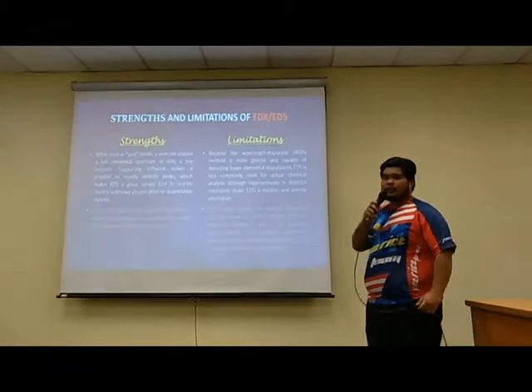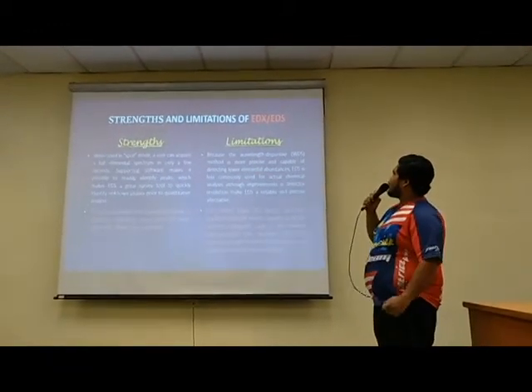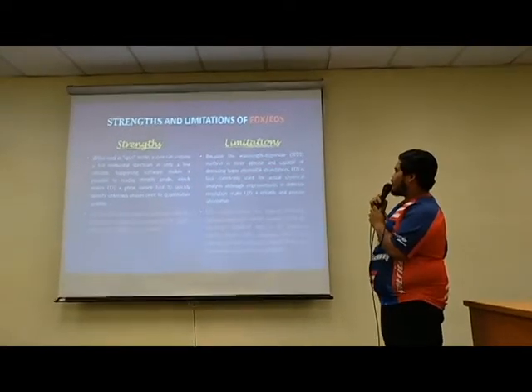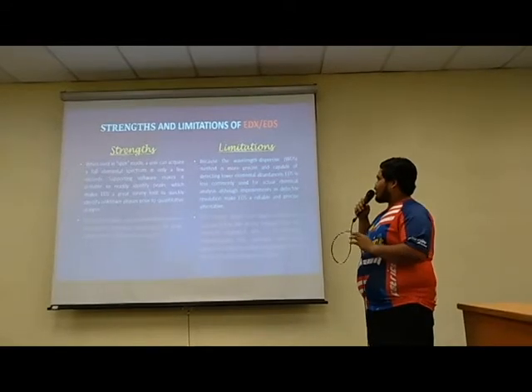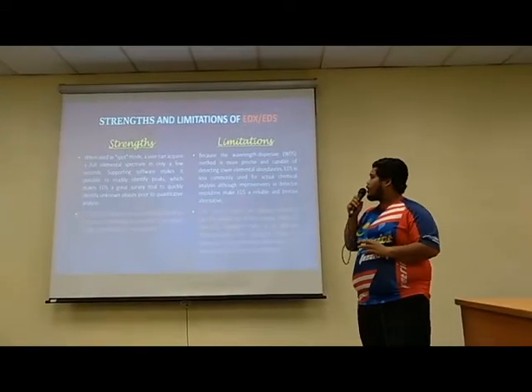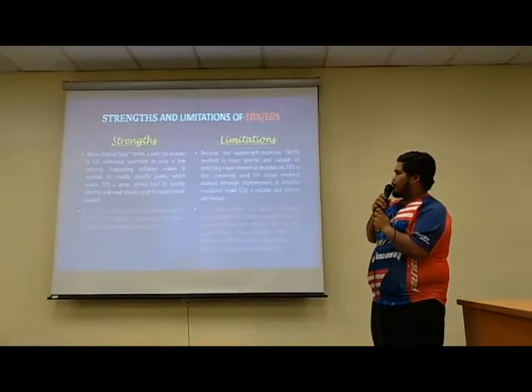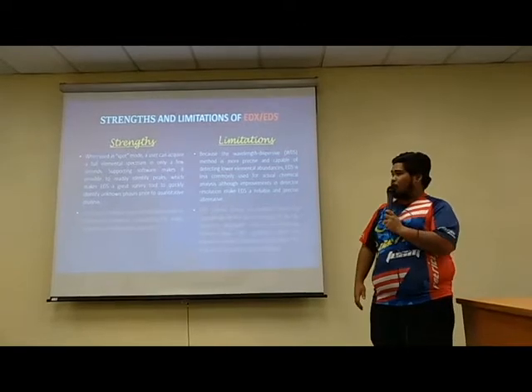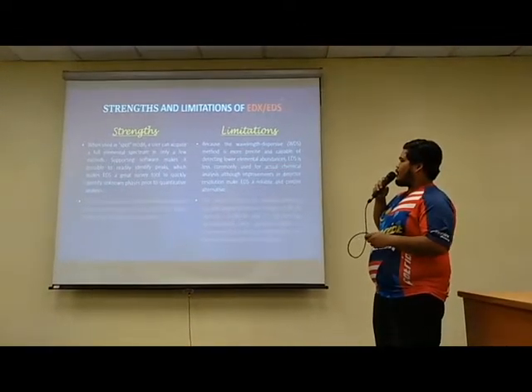Okay, hi, I'm Azfar. So we talk about the strengths and limitations of EDX and also EDS. The strength is that when it's used in spot mode, a user can acquire a full elemental spectrum in only a few seconds. The software makes it possible to readily identify the elements. So EDS is a great survey tool to quickly identify element phases prior to doing quantitative analysis.